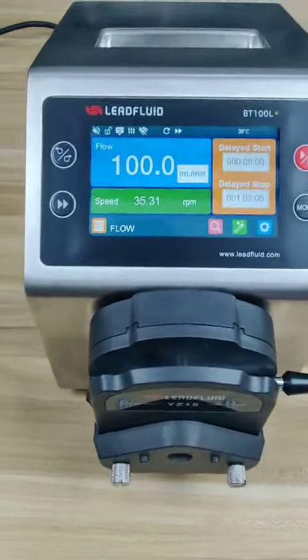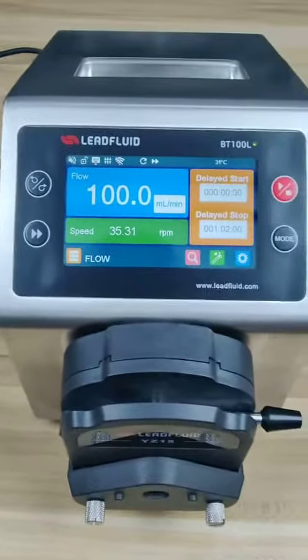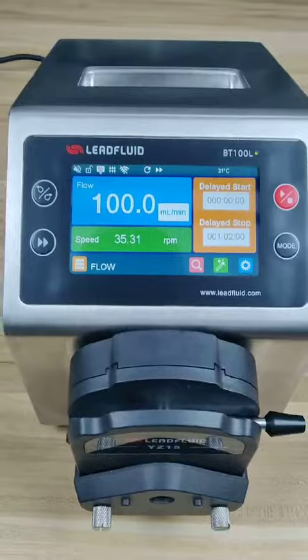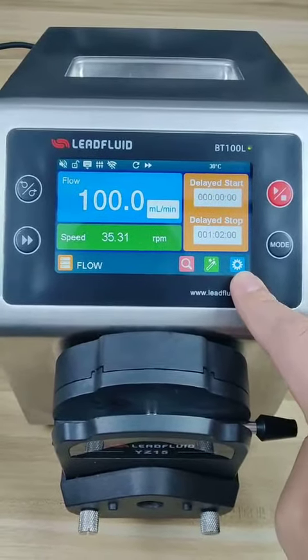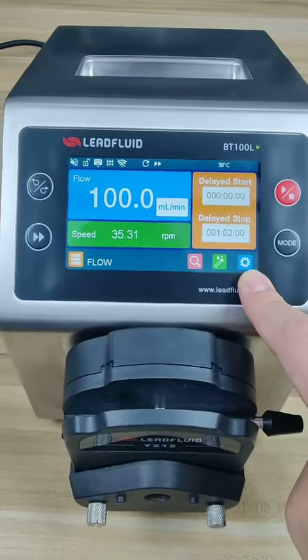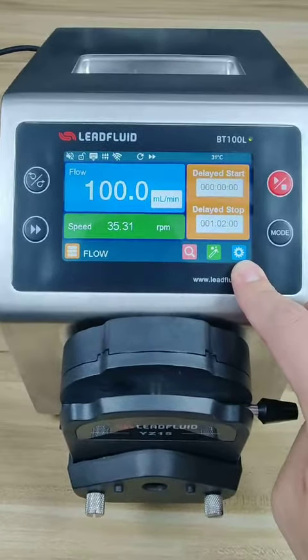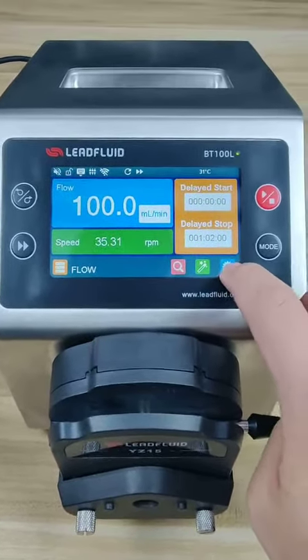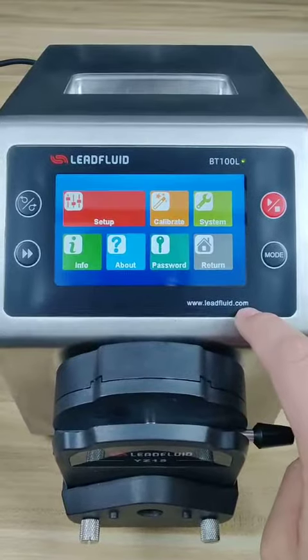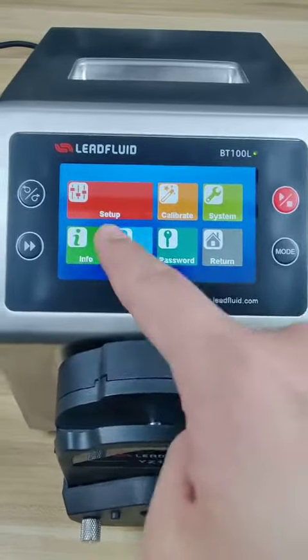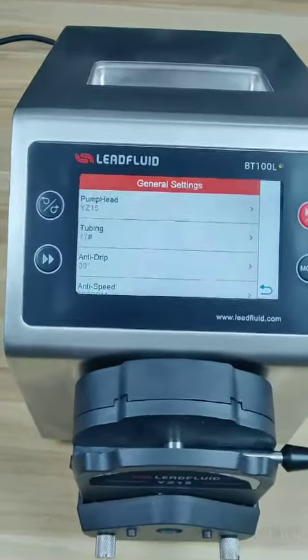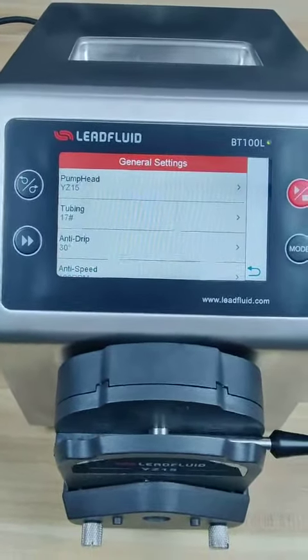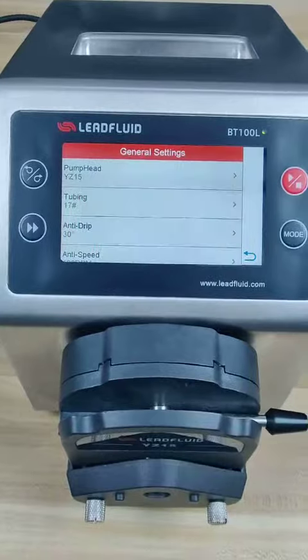First, when you start this pump for use, you should set some parameters in the settings. Press this button. In the setup, you should choose your pump head and tubing.